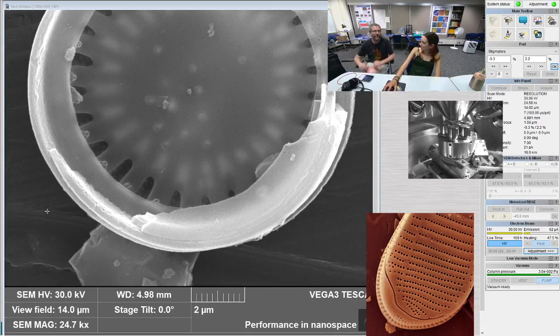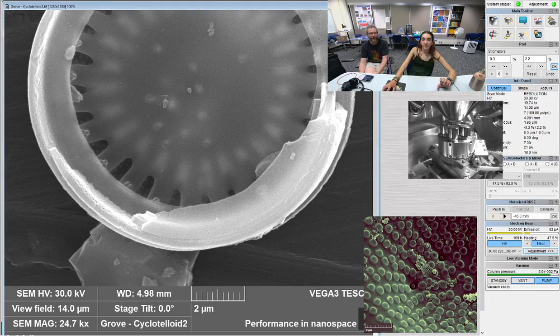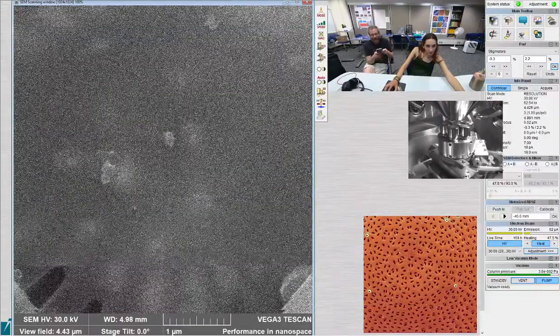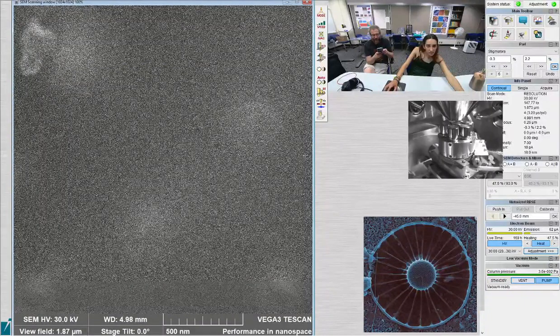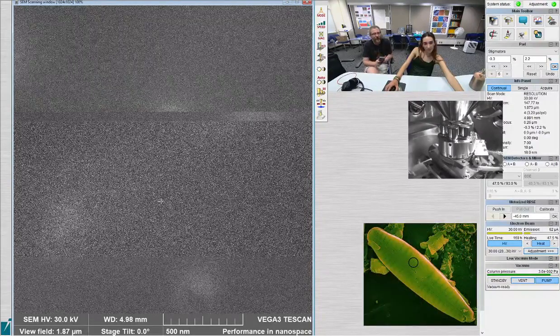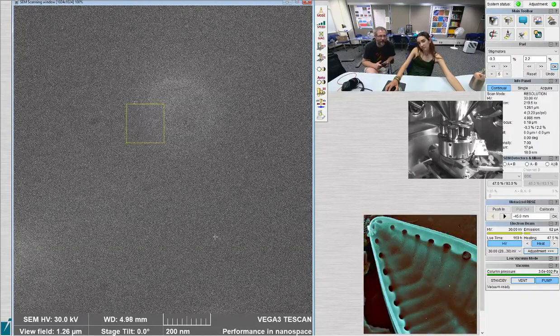So how do we name this one for the sake of saving the picture? Cyclotelloid. And I don't know which species it was. I think probably two, but whatever. Just throw a name on it. We'll figure it out later. Yes, the cyclo part of Cyclotella kind of reveals the shape, and that's the way good taxonomic names typically work. They tell you something about the shape of the organism. So when I name species, I try to use that as my technique as well.